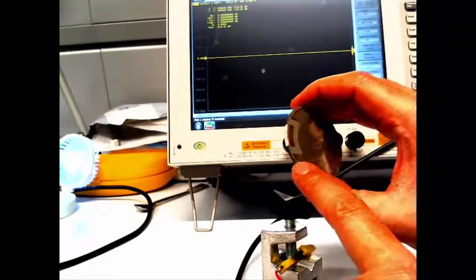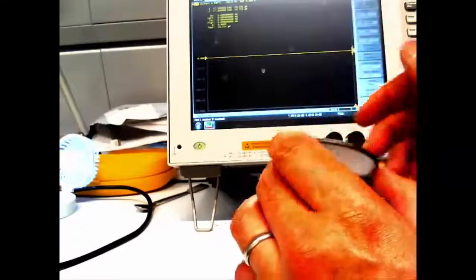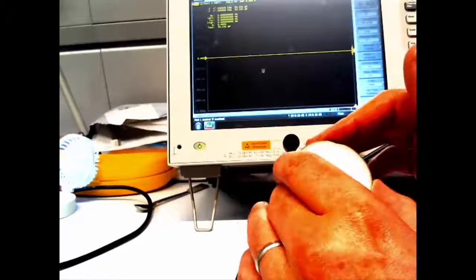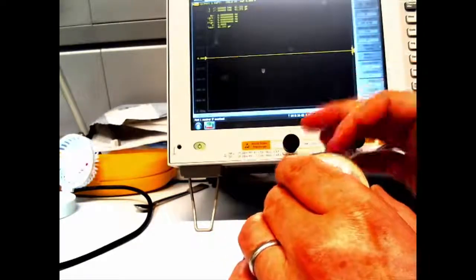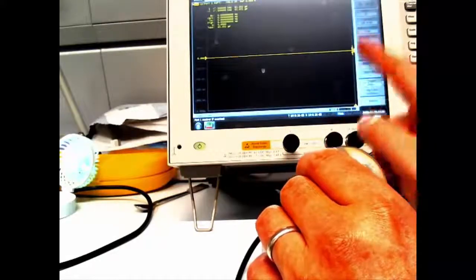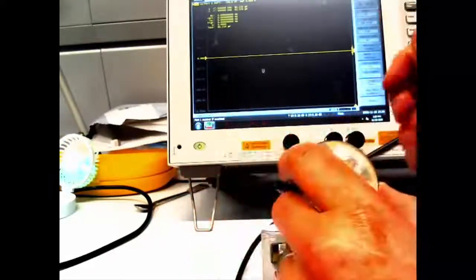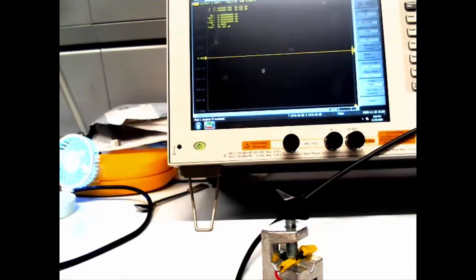This is a big sheet, and it's oscillating, and what it's for is putting onto a bath or putting onto something that we want to shake, and it will shake it really violently. We have to power it a lot more powerfully than this. This is only giving a small kick, so it's only moving a few nanometers. If we want it to do something, we'll have to hit it a bit harder with much more voltage.